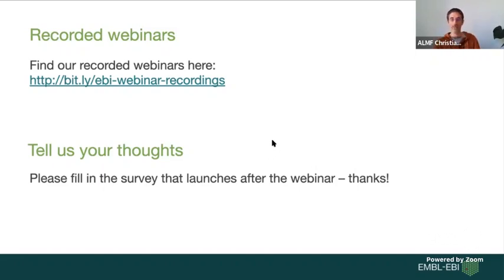Josefina: my lab has an old Imaris license. Is this good software, or should I keep learning Fiji? No, Imaris is great. It's just for publishing, for example, it's always nice if it's something that, let's say, the reviewer of your paper can reproduce, and they will for sure have Fiji and be able to run a macro, but they might not have Imaris.